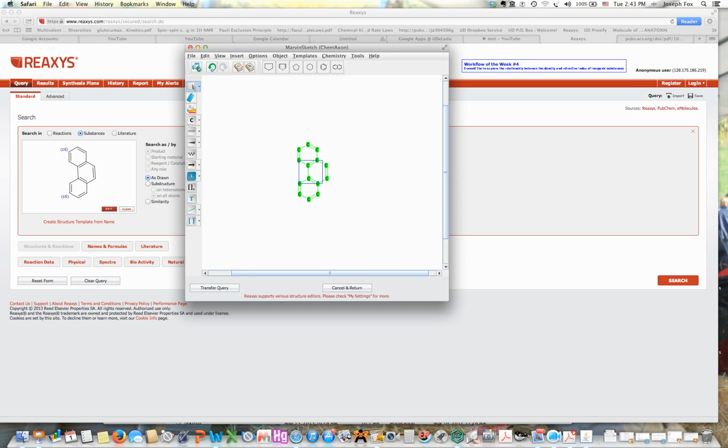Oh my goodness. I'm going to try to move it if I can. There it goes. Okay, so clicking in the middle, I'm going to lasso it, and I'm going to hit Command C. I'm going to see if I can edit, copy that. Sometimes it lets me do this, sometimes it doesn't. Here, let me paste it.